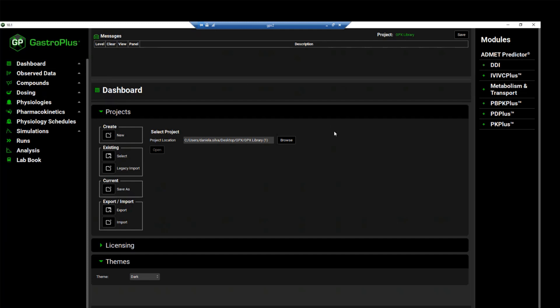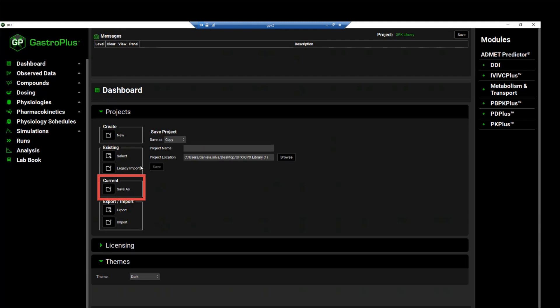Before we do our exercise, we will save a copy of this project. To do so, click on the icon next to save as and leave the copy selected from the save as dropdown.